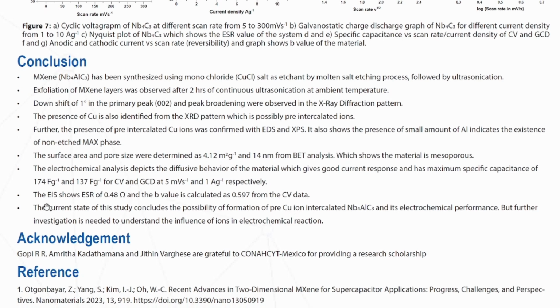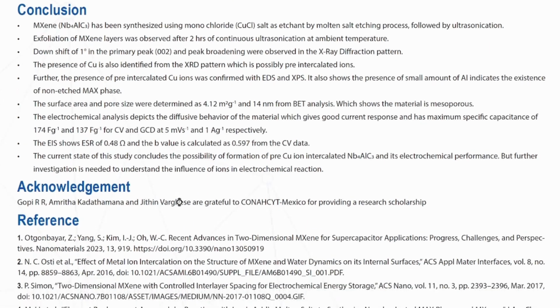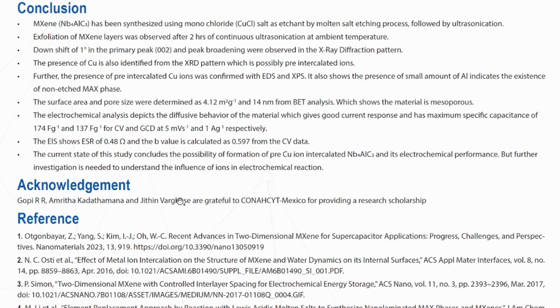And the EIS shows good conductivity, and from the logarithmic graph, the b value is calculated as 0.59, which is also good diffusive behavior. From the current state of this work, we have successfully proved that CuCl could be used to synthesize MXene through molten salt etching.